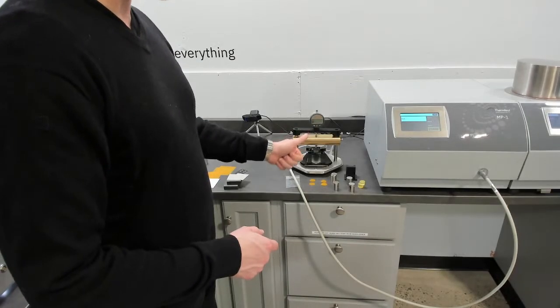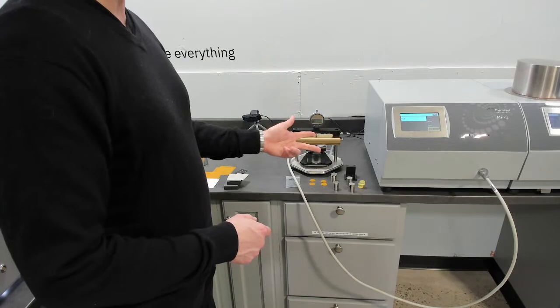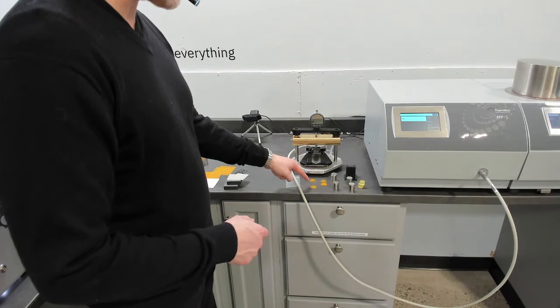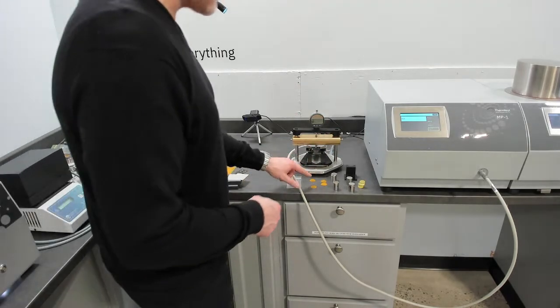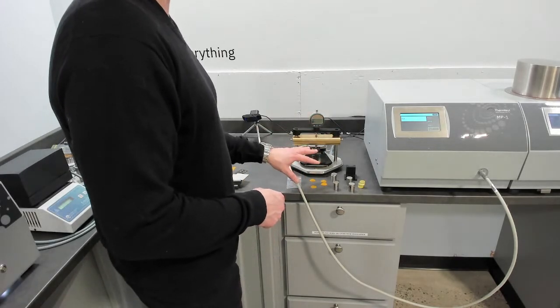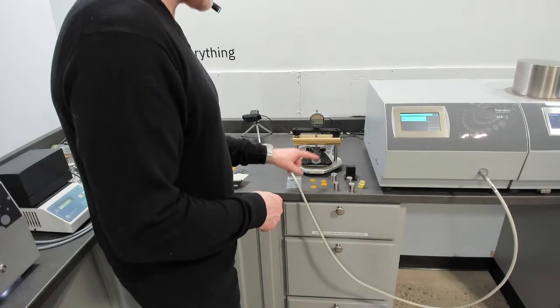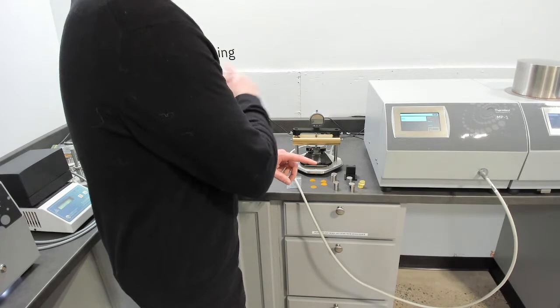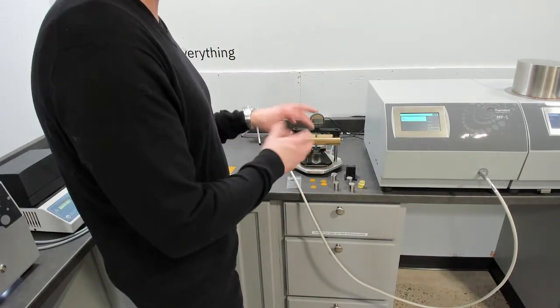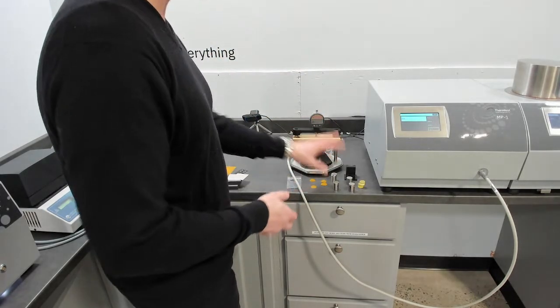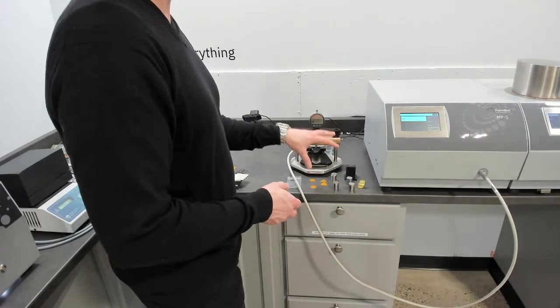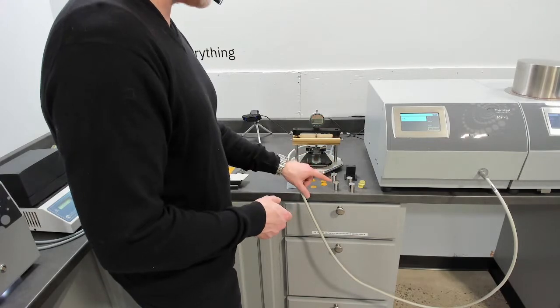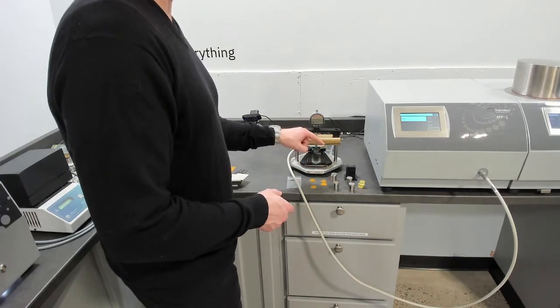So you can approach thin films, adhesives and bonding agents and tapes in much the same configuration. Now, the key difference is on freestanding films, we want to make sure we do this multi-layer approach to remove the effects of contact resistance. And the reason why we could do this multi-layer approach here versus the ISO approach to thin films, because we're actually measuring resistance. This is the more appropriate way to do it. And we know precisely the resistance change and the effects of the thickness and resistance change.